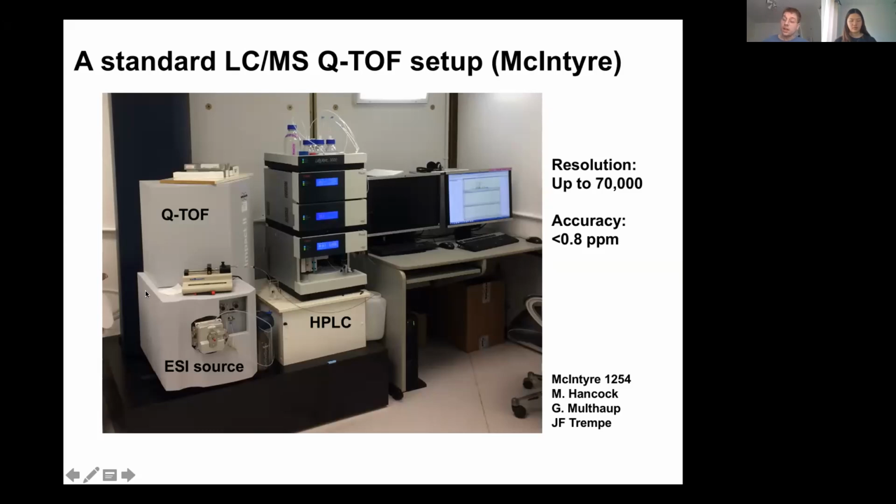There's another really common kind of mass spec, which is called an orbitrap, that I won't get into, but the orbitrap is a little bit higher sensitivity than the QTOF, and that's what will be used if you send out samples to a proteomics facility or something like that. But the premise is pretty much the basic components that I outlined earlier are still the same.